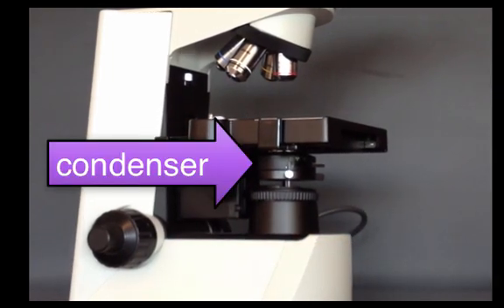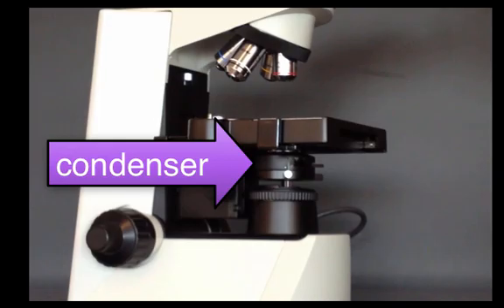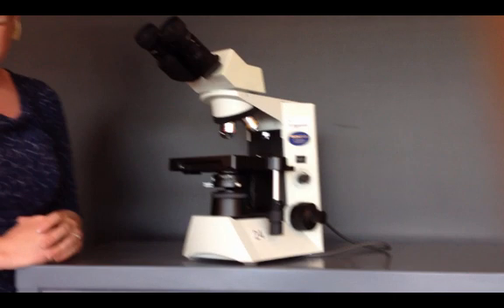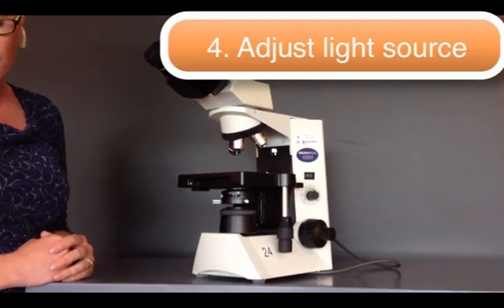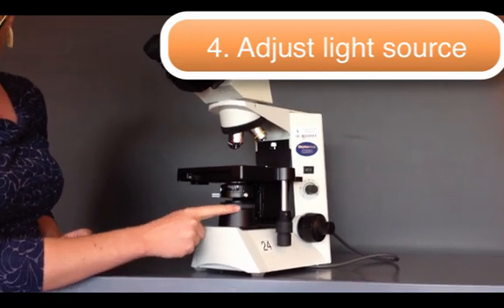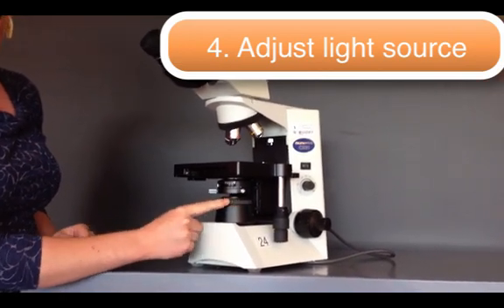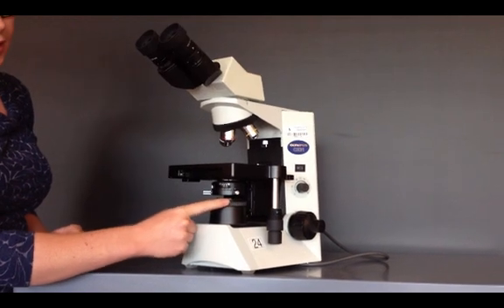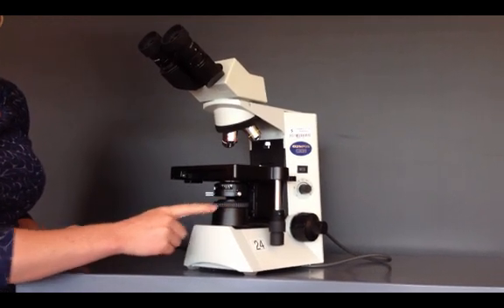The condenser controls your focus for your depth perception. Next, you need to make sure that the light source is turned all the way open. You see this wheel down here. You want it to be all the way open, which is clockwise. That's going to allow the maximum amount of light in.